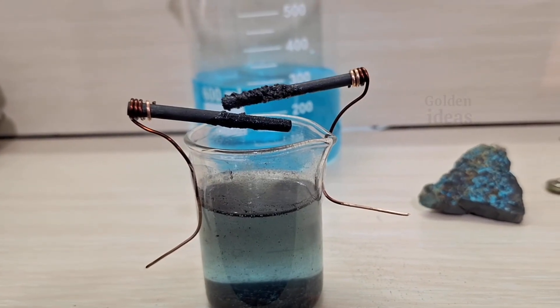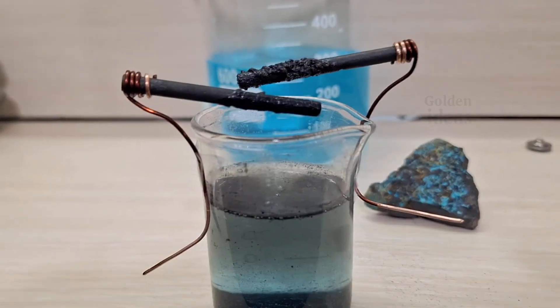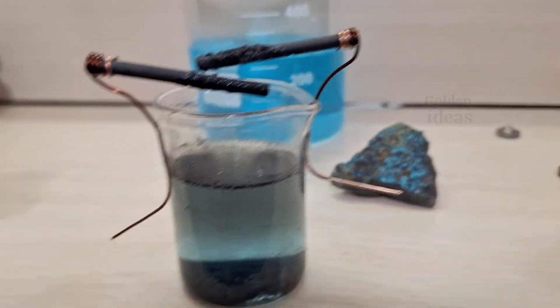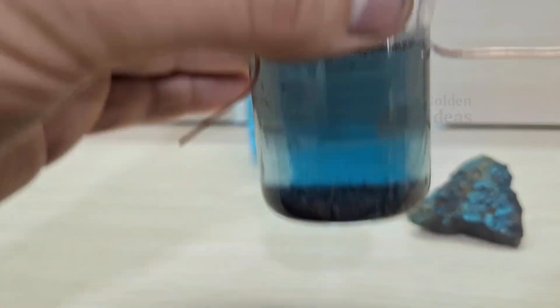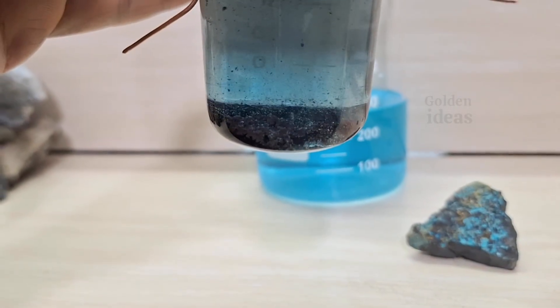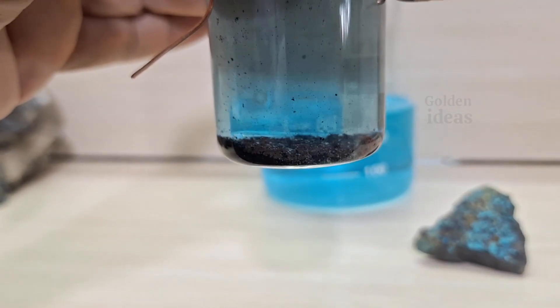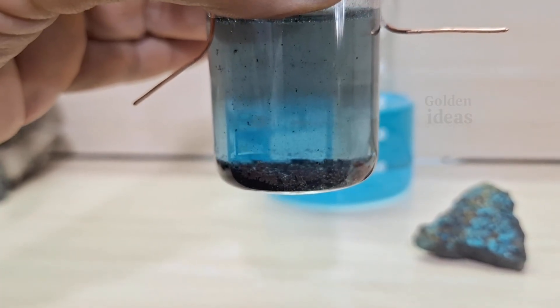In cyanide solution electrolysis, the conditions are slightly different, and I'll cover that in a separate video. As you can see, all the elements in the solution have precipitated as metallic powder, ready for melting.